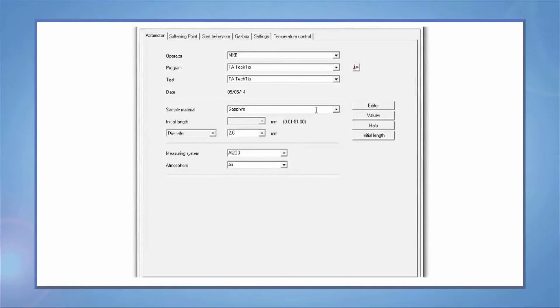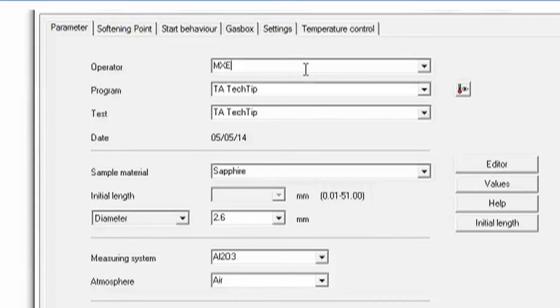Select New Measurement and the new Options screen will come up with multiple tabs. The operator, program, test name, and sample material.